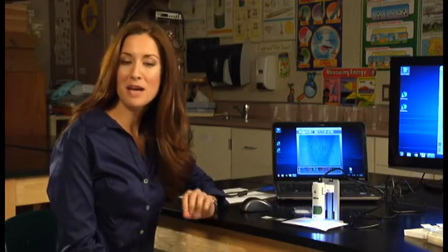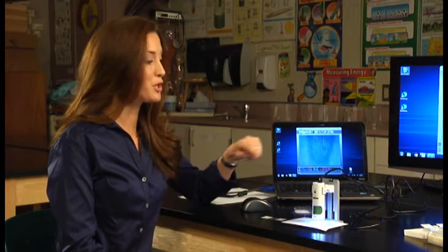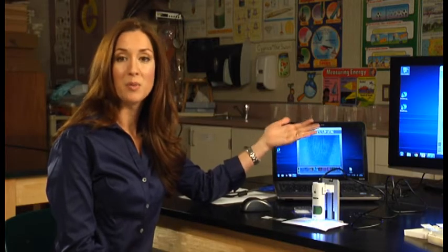The SmartScope 500 has a fixed magnification of 500x, and teachers are using this to show students what they should be looking for in their traditional microscopes. You can hook the SmartScope right up to your own computer and then project the images throughout the classroom, whether that's on the screen or an interactive whiteboard.